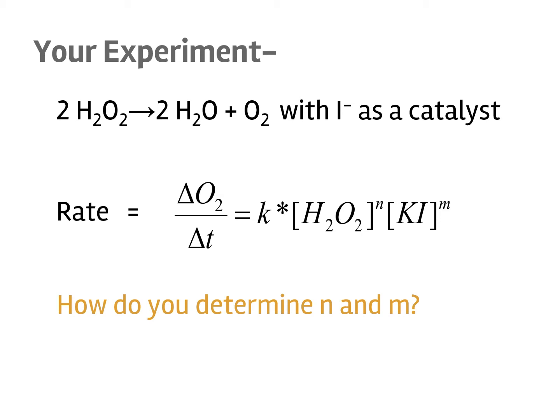We are also going to vary the concentration of the potassium iodide and the hydrogen peroxide. And finally, we will carry out the experiment under two sets of conditions. One at room temperature, which is about 25 degrees Celsius, and the other one would be at a higher temperature, about 45 degrees Celsius. And so having these three factors in play, we are going to see how the volume of oxygen production changes when these three factors are at play.